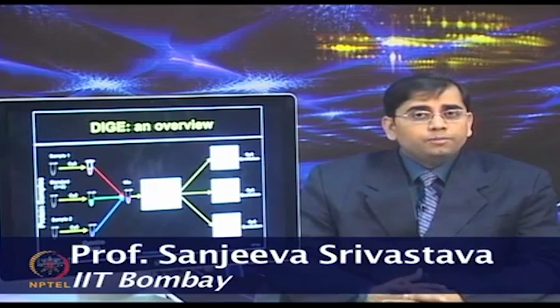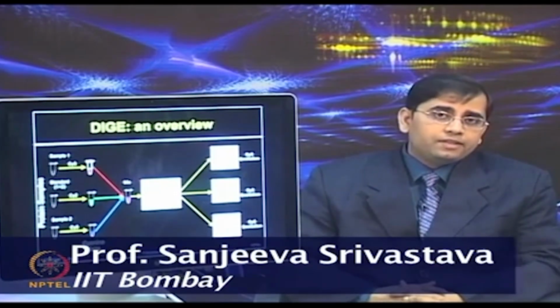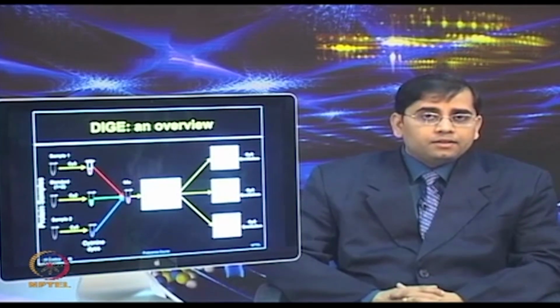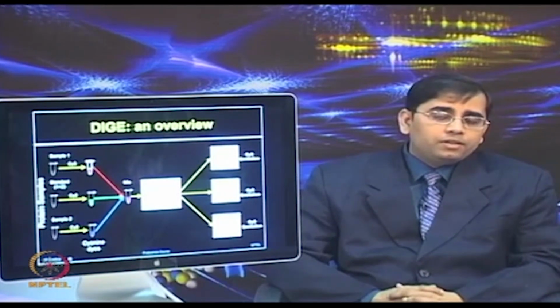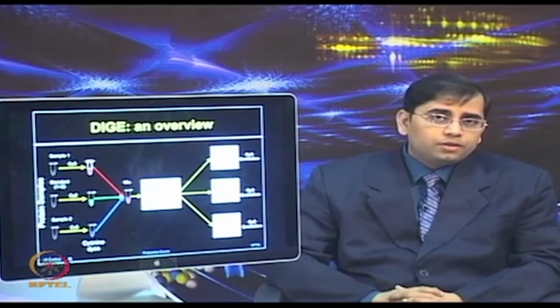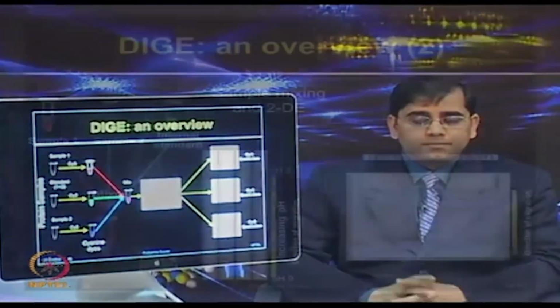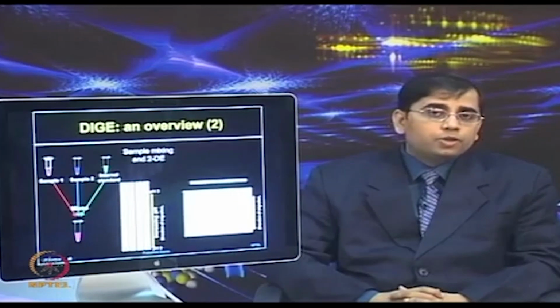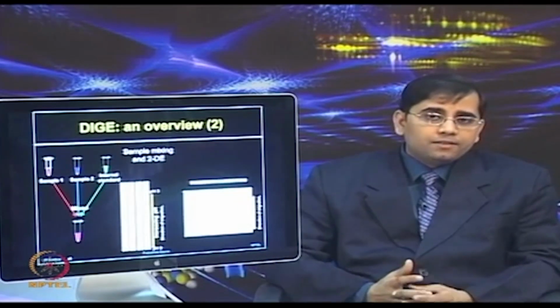All this protein mixture is separated in the first dimension on the same strip, and then the same gel can be scanned with 3 different wavelengths to obtain the images for Cy2, Cy3 and Cy5. In conventional 2-dimensional electrophoresis, the gel to gel variations come from acrylamide polymerization, electrical, pH and thermal fluctuations in different gels.